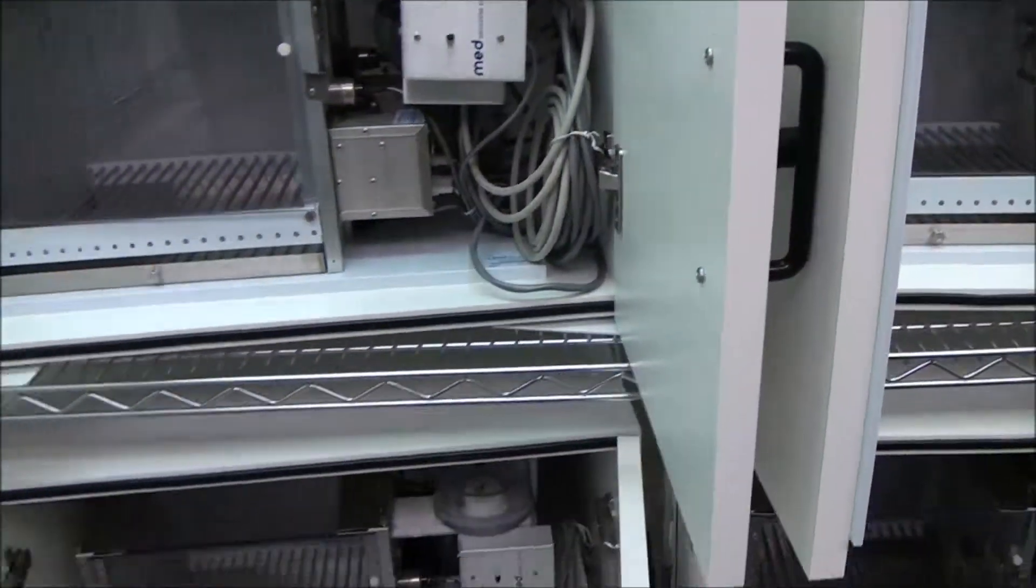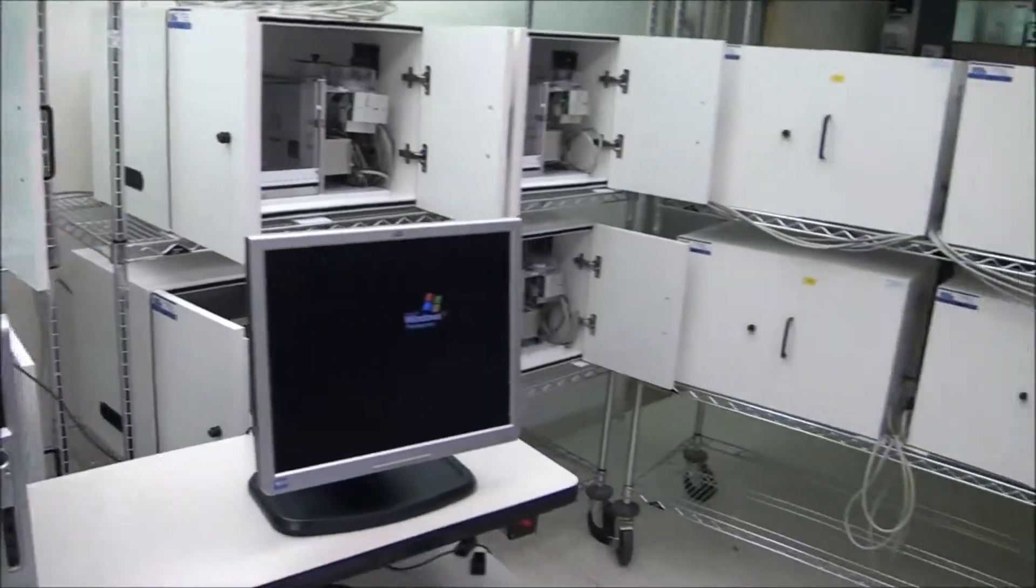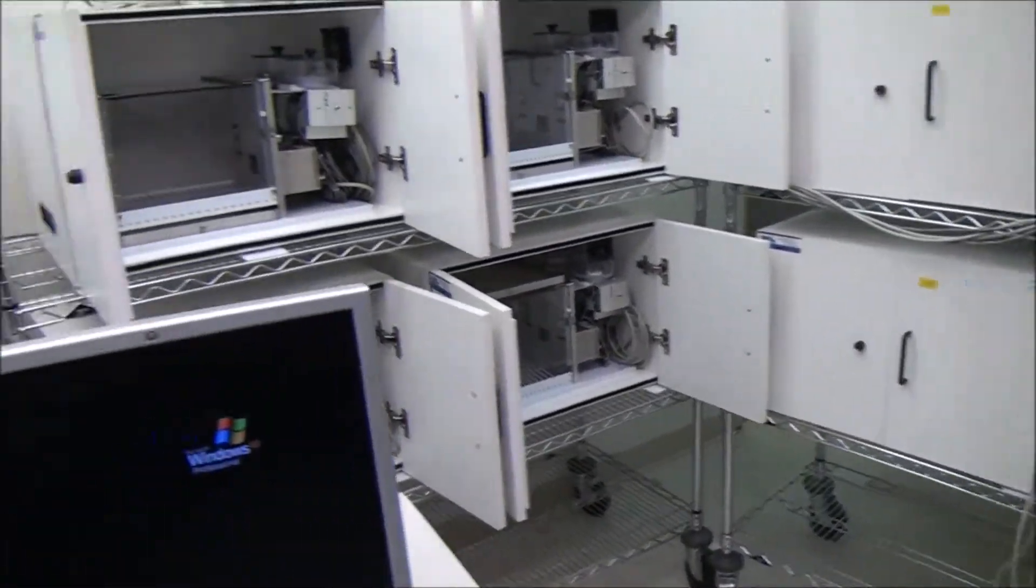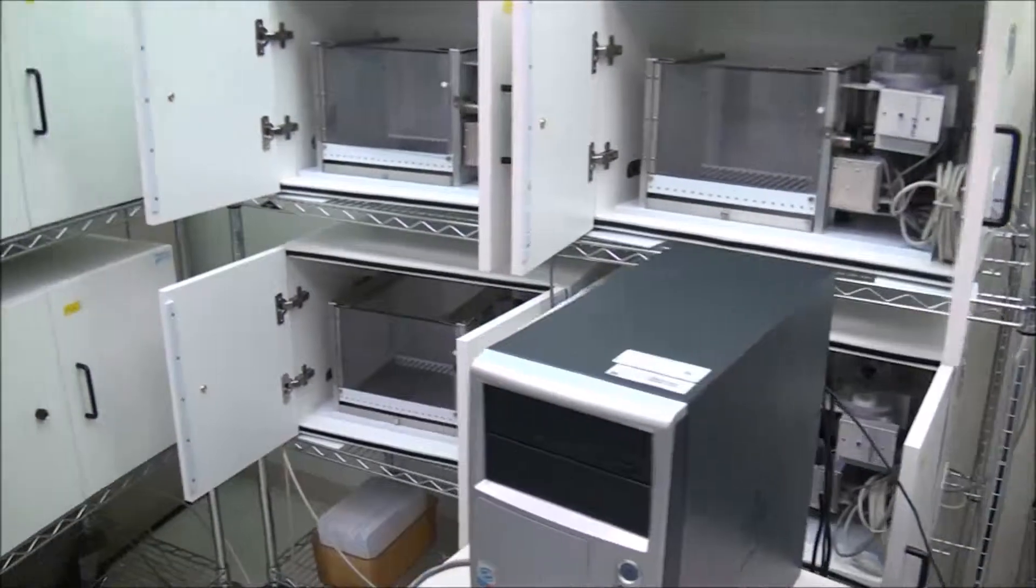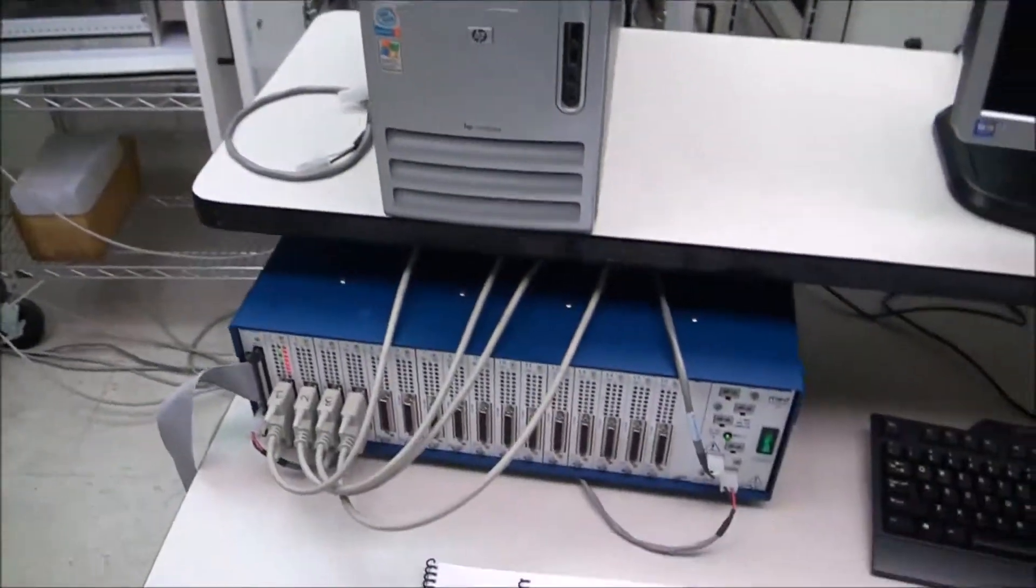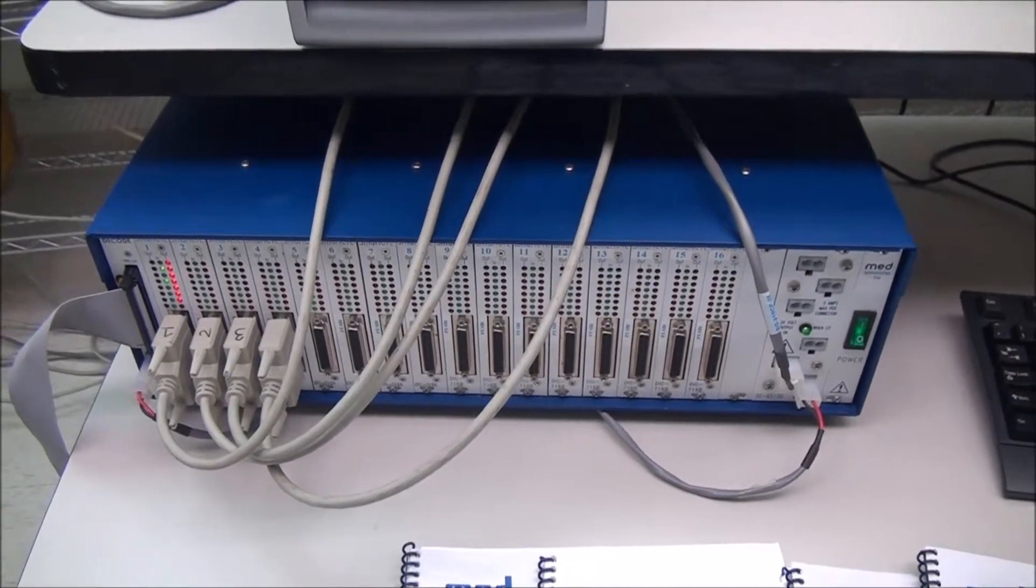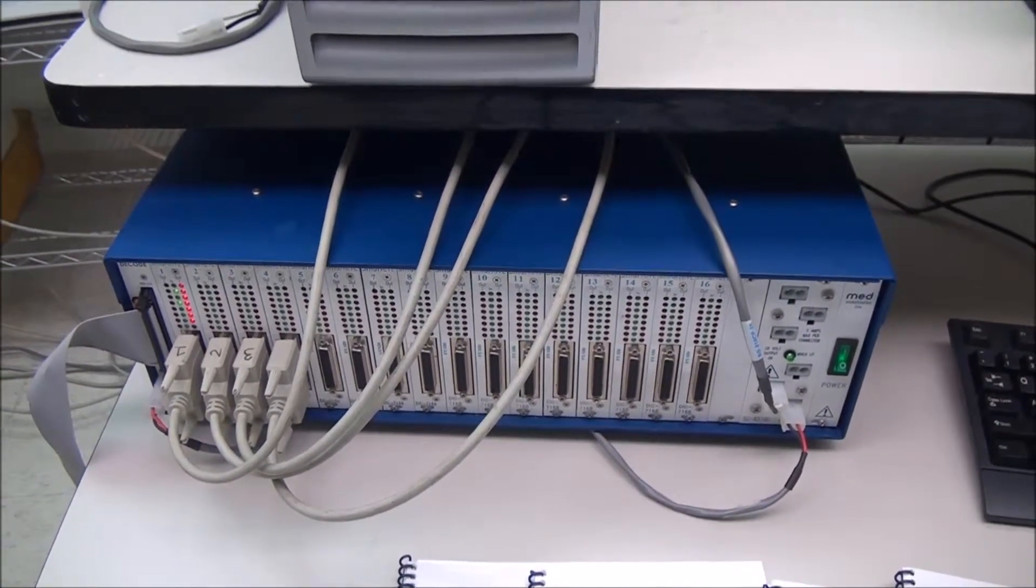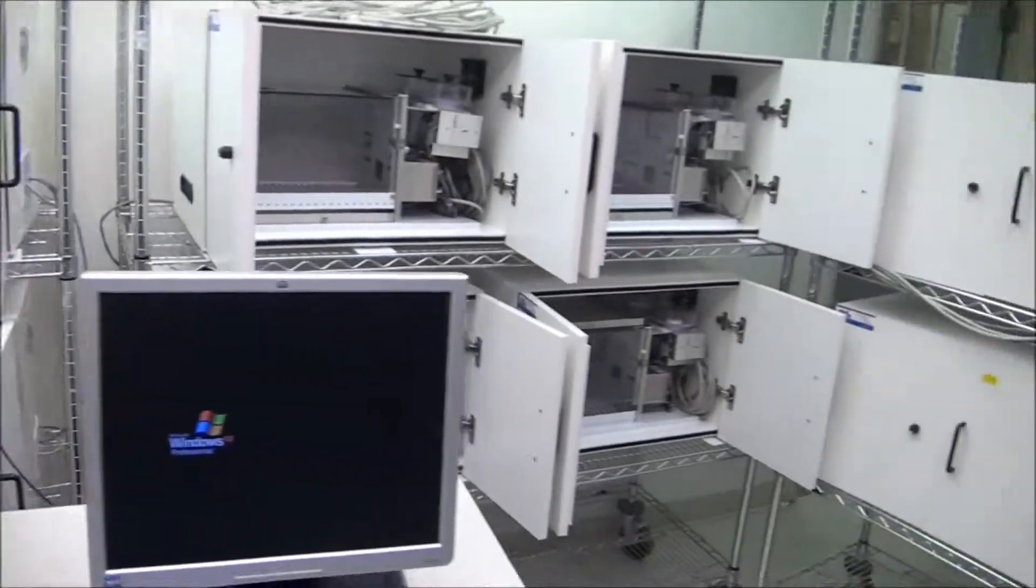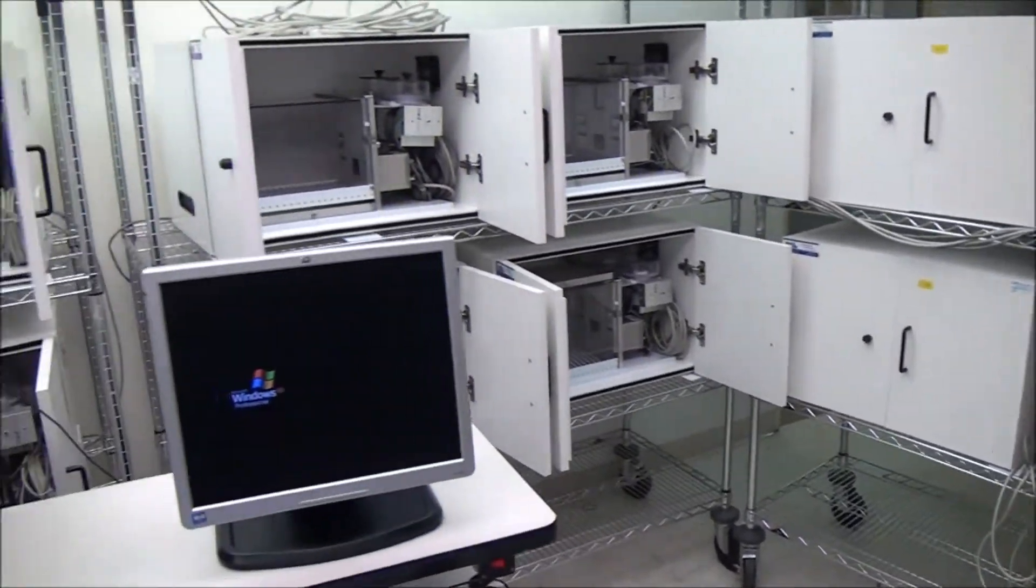And we are trying to sell this as one complete package. But if you can't use 16 boxes, we are willing to split this system in half. You will not get the 16 card cabinet. We will get a smaller cabinet that will fit the eight cards and then give you the eight boxes along with the software. But you can see our listing for the prices on that.